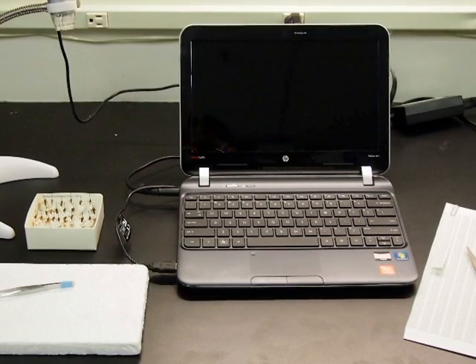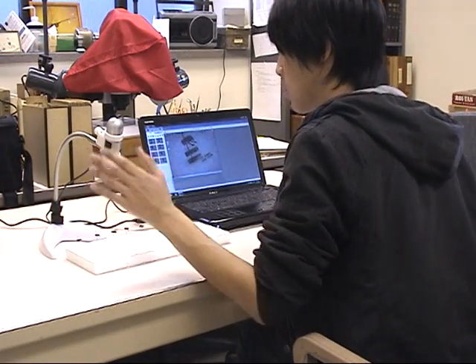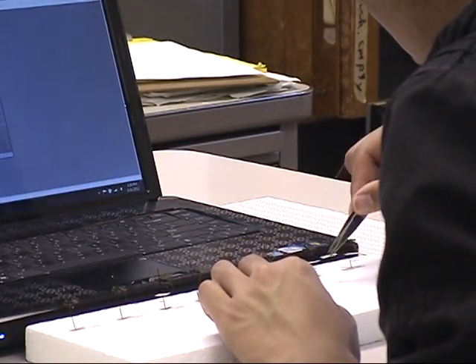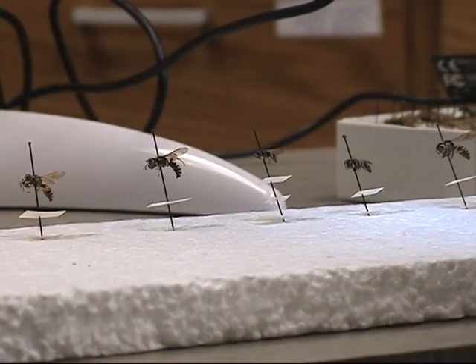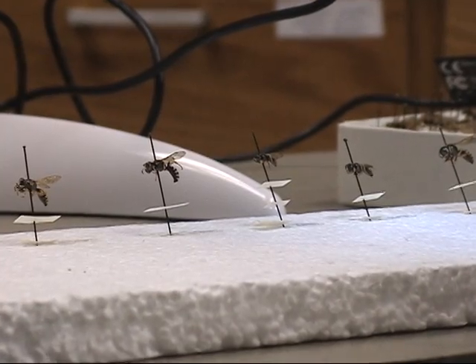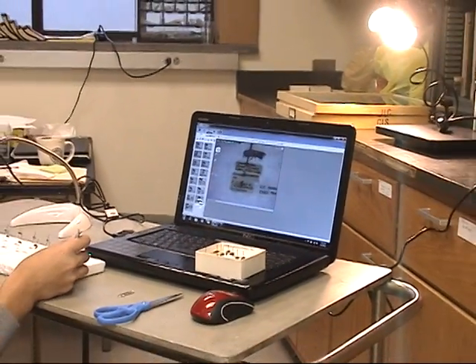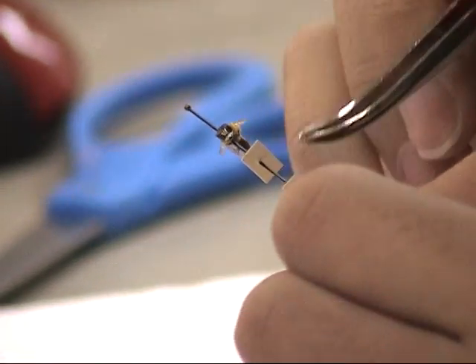Start up the computer and the image viewing program. Make sure the camera is connected to your computer and that the viewing program is working. Line specimens from left to right on a styrofoam block, leaving several inches of space between each specimen. Each specimen must have the head to the left and abdomen to the right. All labels must be oriented so you can clearly read them in the image. This may require using forceps to space and angle the labels appropriately on the pin.